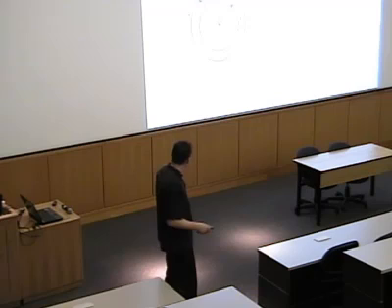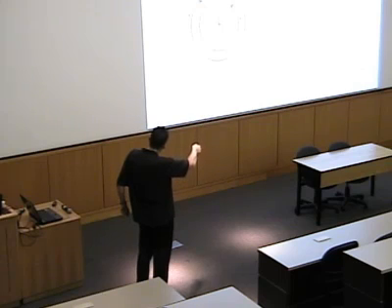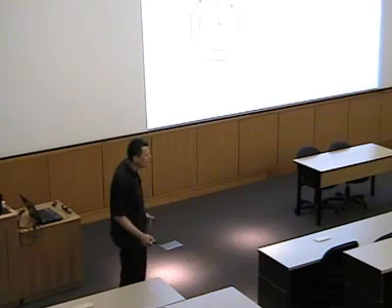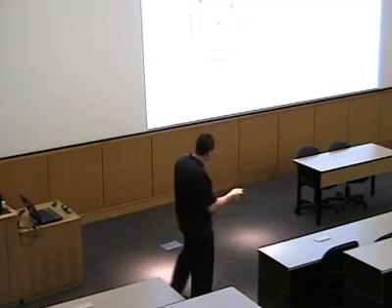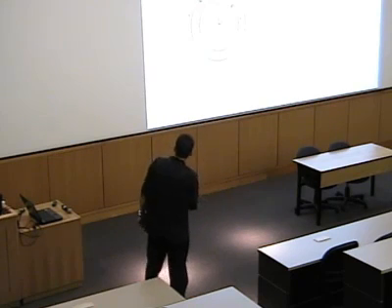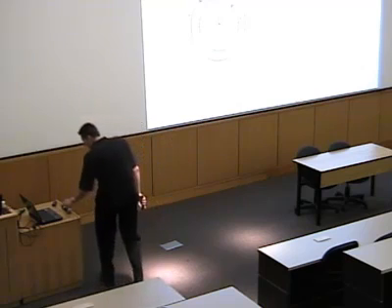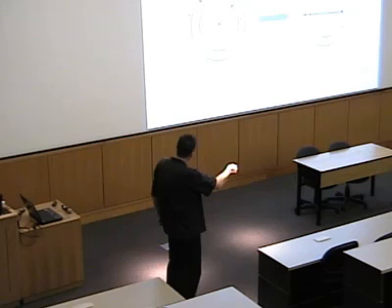Well, if we now go back to our picture, and we have our light waves passing through our medium, but now we absorb, and in my case, I am absorbing the right circular polarized wave more than the left circular polarized wave. So you can see my amplitudes now are different, right? They're not the same anymore. So you can already see what's going to happen, they're not going to cancel each other out anymore, exactly. So in this position here, if I add them up, I end up with this superposition here. This is the resulting electric field vector. Now I'll let them rotate, and then if I go to the critical position, 180 degrees, right? Before that, this exactly cancels to 0, but now there is a residual field component here.